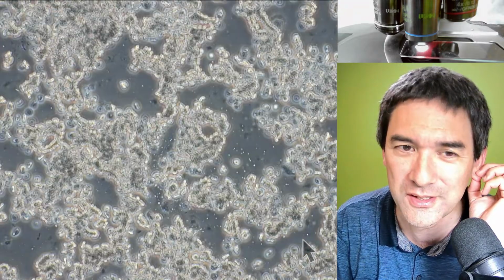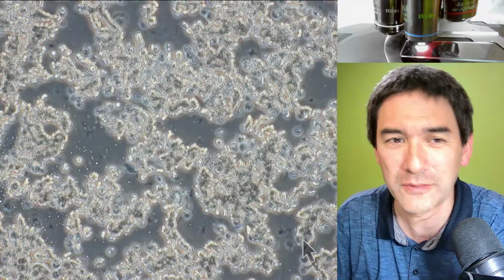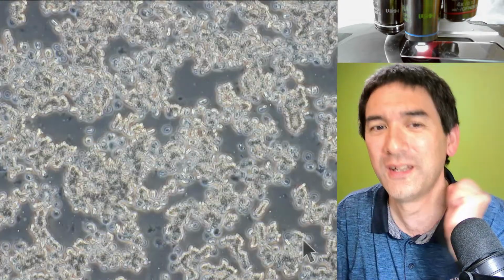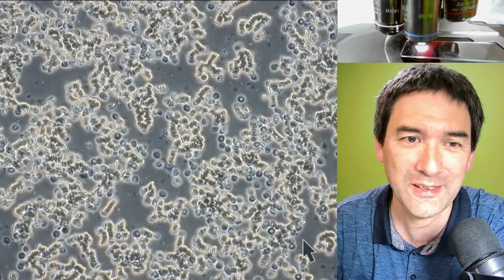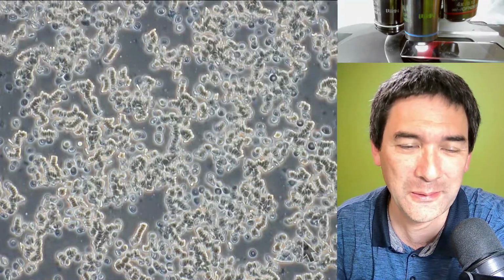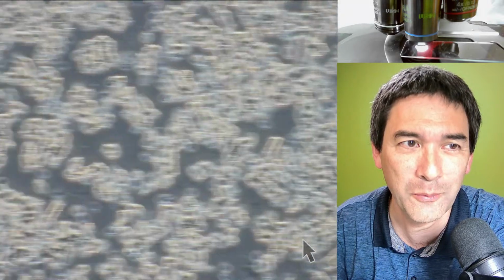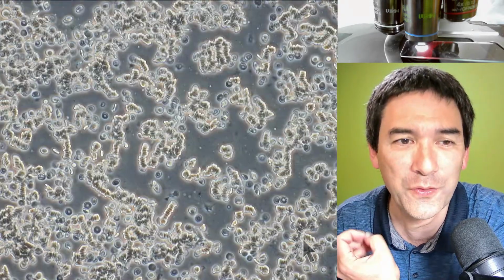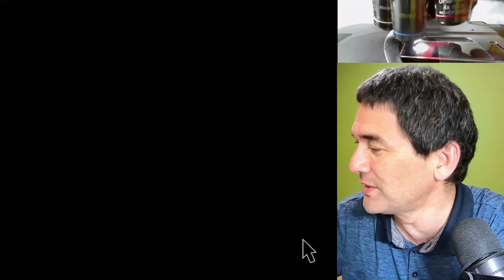And then the doctor says you should be drinking a little bit more. Then I had to drink a couple of glasses of water, and then they were able to draw the liquid again. So, to show you that this also depends quite a little bit on how much water you drink. It determines also how thick or viscous the blood is. Here again, very nicely, we're able to see some of those stacks.